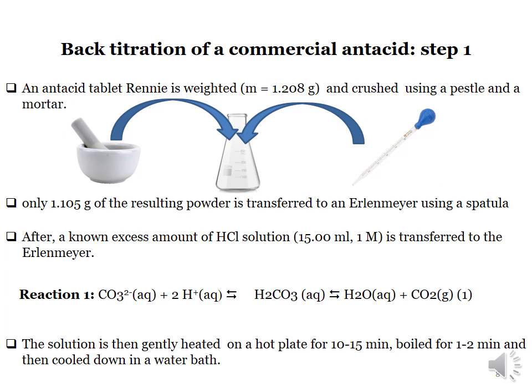And of course, we can't conduct a titration under heat. So we cool it down in order to titrate it thereafter. But by doing this, we transform the reversible reaction into a straight, complete reaction. Yes? And by doing this, we break the buffer.